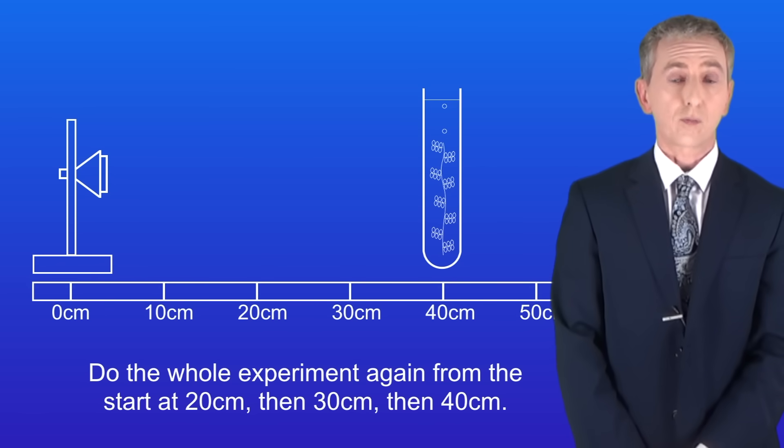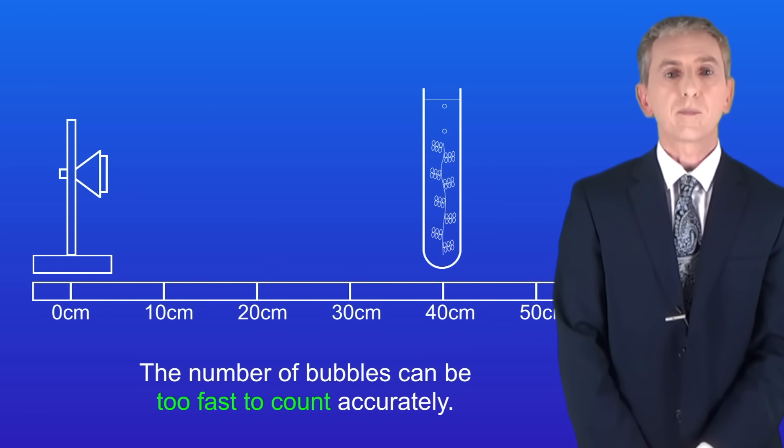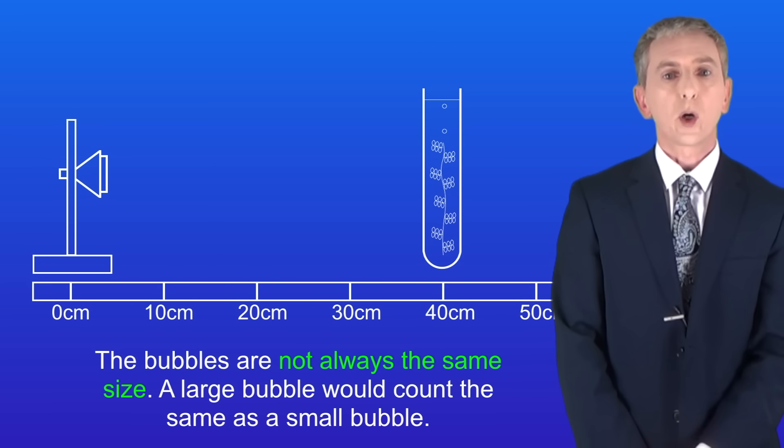There are two main problems with this practical. Firstly the number of bubbles can be too fast to count accurately. Secondly the bubbles are not always the same size, so a large bubble would count the same as a small bubble.